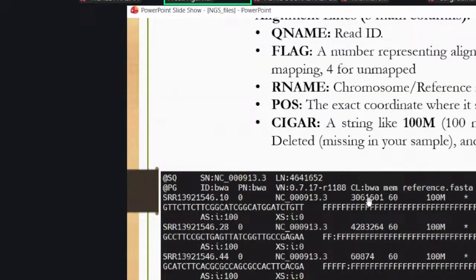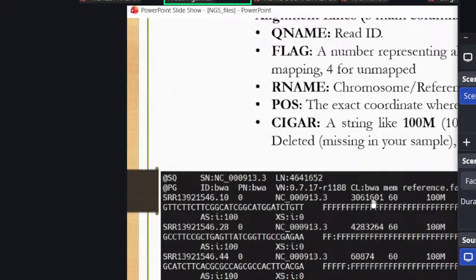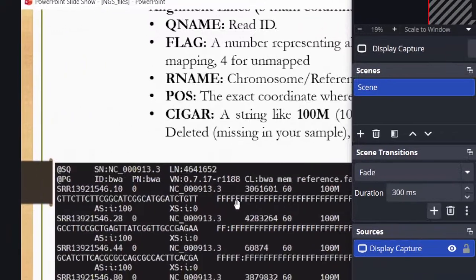You guys are correctly saying, Ishita Pal, Anumita, Ariba, all of you are answering it very correctly. Unmapped is the answer. If there is an asterisk in the third and fourth column, it is because a particular read has not mapped, so it won't show the ID of the reference and won't show any position. That's why the answer is unmapped.